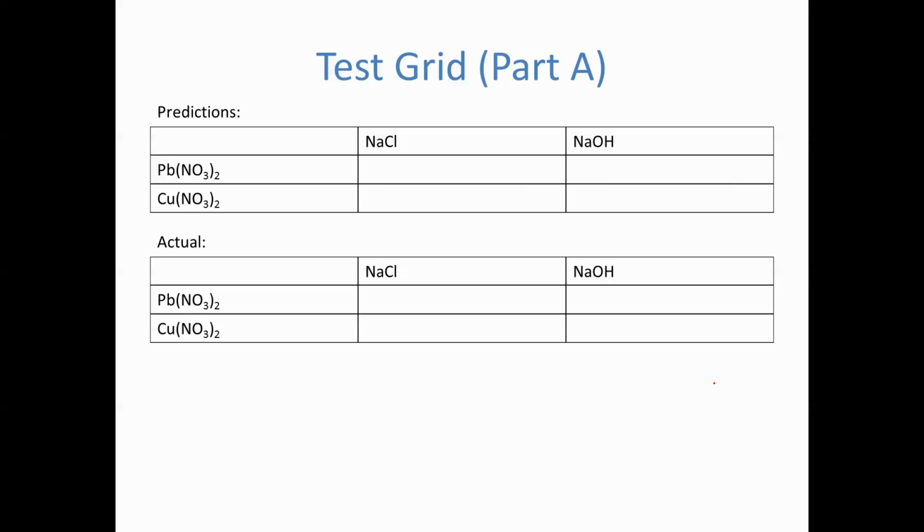One of the things you'll be required to do in this lab is create test grids. So I have made some test grids. They're a bit smaller than the ones we'll be doing in the lab. These are 2 by 2 instead of the 3 by 4s that you'll be doing in the lab. But the concept's the same.